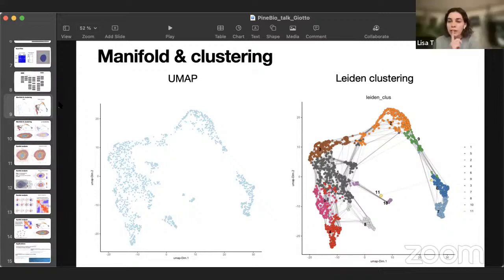Actually, one more thing, Juliet made a good point that Visium is not single cell resolution. There are studies when just regular single cell and spatial single cell are combined together. So you get the spatial information, but at the same time, you can kind of get the single cell resolution. So yeah, I think single cell won't go anywhere. We'll use it.